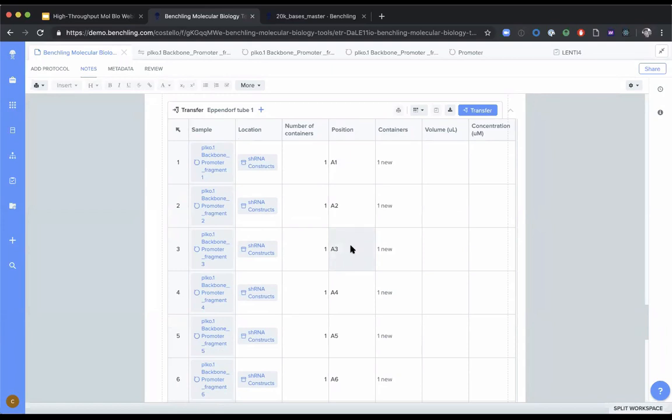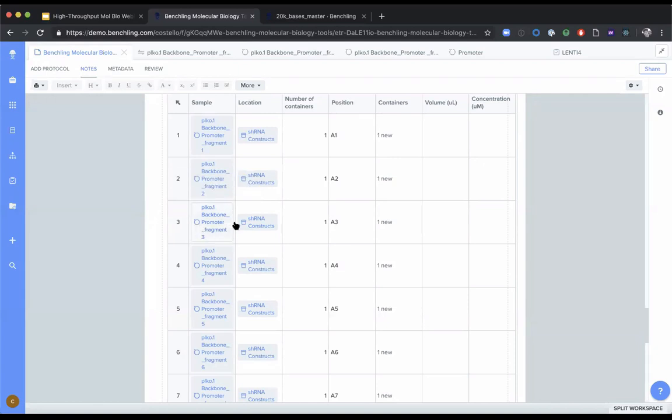This is also particularly useful if the scientist wanted to go back and tell the requester what the plasmid was that I designed and where it's stored. They can actually reference the same information from the notebook entry that we're collaborating on.